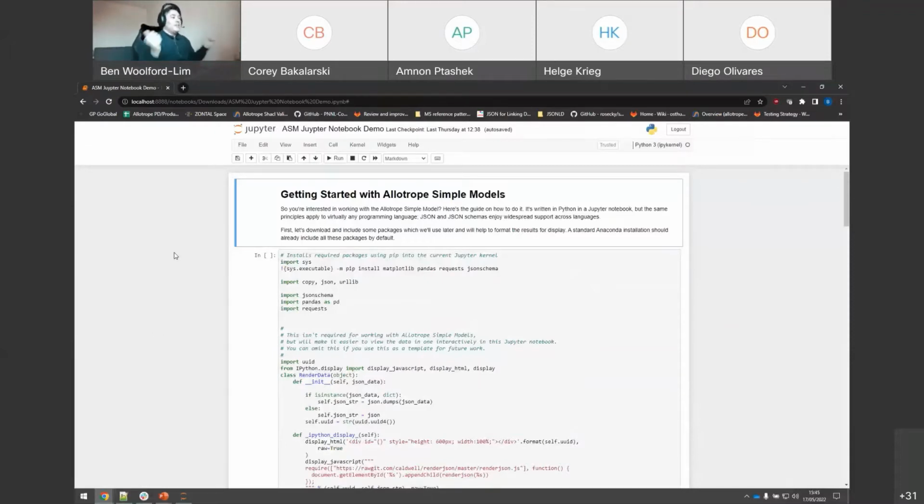That's great. Wonderful. So this is a Jupyter notebook. For those who know data science, you probably have seen hundreds of these. For those who haven't, it's just a useful way of representing text, data, and images all in one file. You can literally run the code as you go, so you can very easily put together almost self-actuating reports in some regards. And it's a very common tool for data scientists, amongst other users, to work with data.